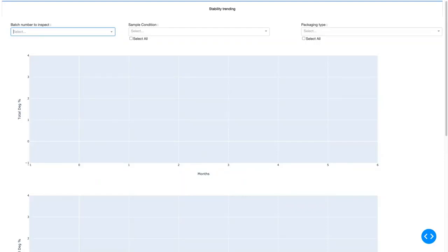So we have a concrete problem here, which is we have an analytical project leader, and she's in TRD Novartis, and she has to regularly trend stability data to understand the behavior of a batch. So for example, she has just received her last time point result, and so she needs to make sure that it's in line with all the previous points. Currently, the way that she does this is that she enters information from various different systems into an Excel sheet manually. Clearly, this is not the best way to deal with her data.